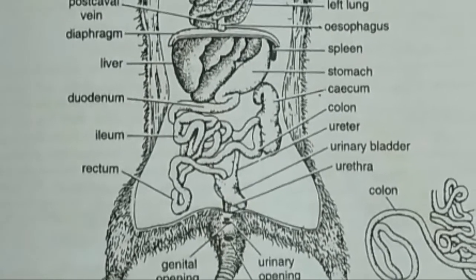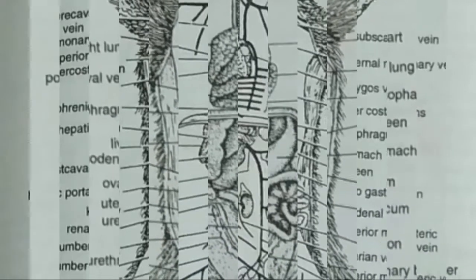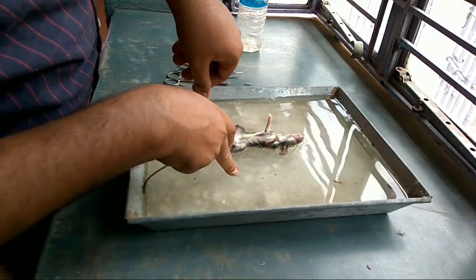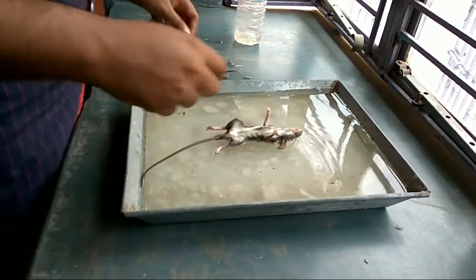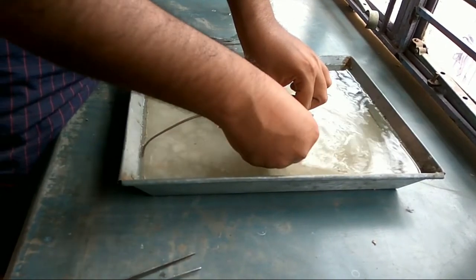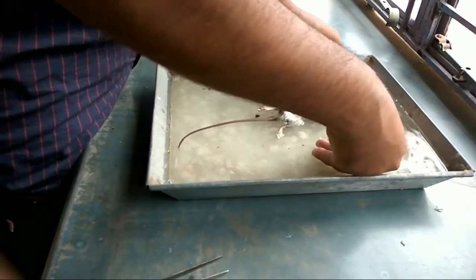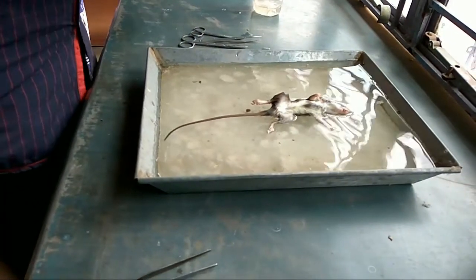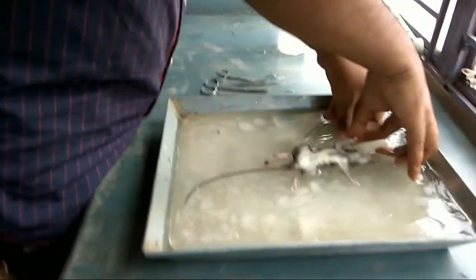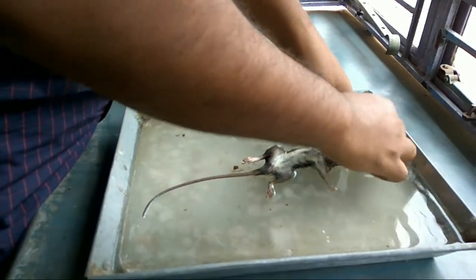Hello guys, today I'm going to show you how to dissect a rat. I have taken Ratus bengalensis for this purpose. First, put the specimen on its back on a dissecting tray and fix the limbs with pins. As the rat is a vertebrate, we have to dissect it through the ventral surface, as the nerve cord and vertebral column run through the dorsal surface.